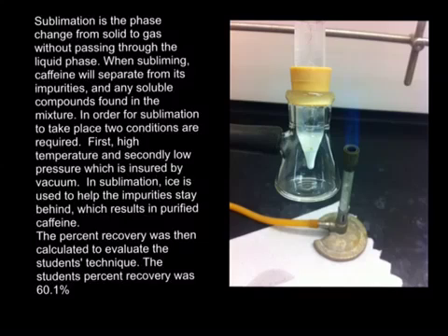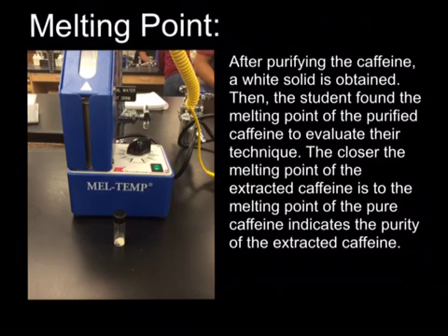The percent recovery was then calculated to evaluate the student's technique. The student's percent recovery was 60.1%. After purifying the caffeine, a white solid is obtained. Then, the student finds the melting point of the purified caffeine to evaluate the technique. The closer the melting point of the extracted caffeine is to the melting point of pure caffeine, the higher the purity of the extracted caffeine.